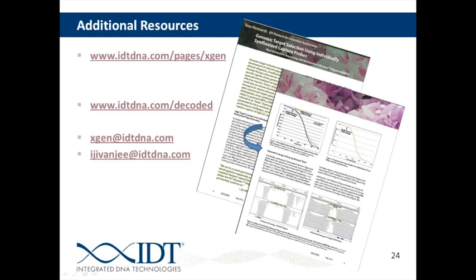This goes along with a lot of the optimization that's needed for NextGen. There's not a great answer for that right now, and part of that depends on how much starting material a person has. What you want to do is obviously minimize the number of cycles you're using for PCR, but you don't want so few cycles that you don't end up with enough product to actually sequence.